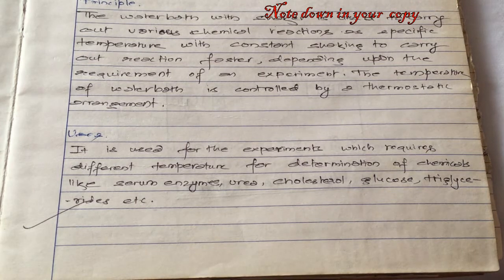Let us now focus on the uses of the water bath with a shaker. It is used for experiments which require different temperatures for determination of chemicals like serum analysis, serum enzymes, urea, cholesterol, glucose, triglycerides, and so on.